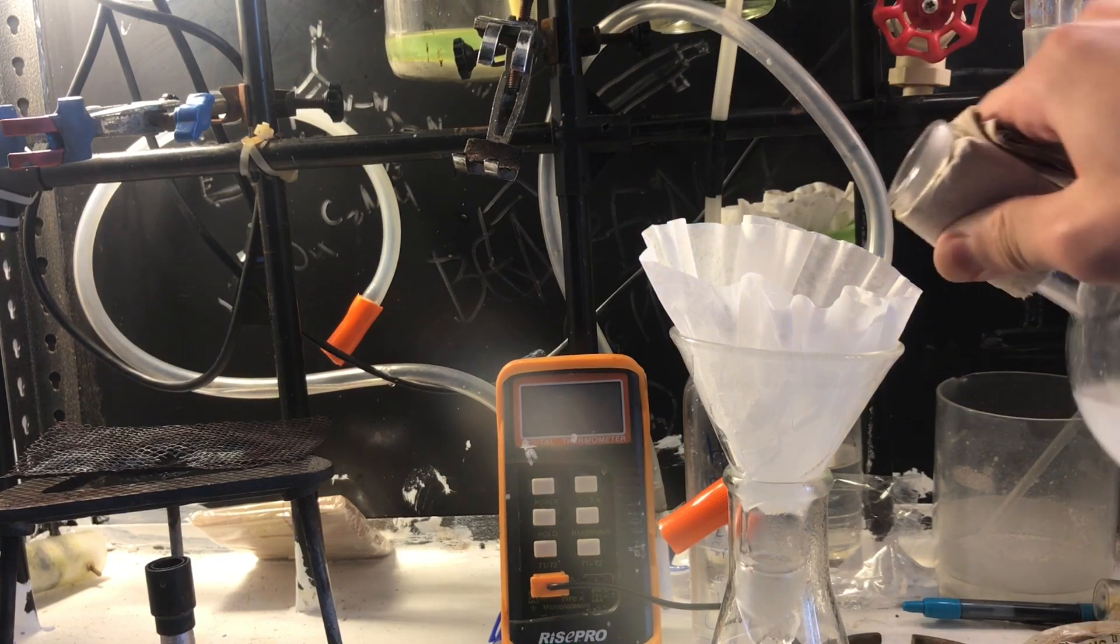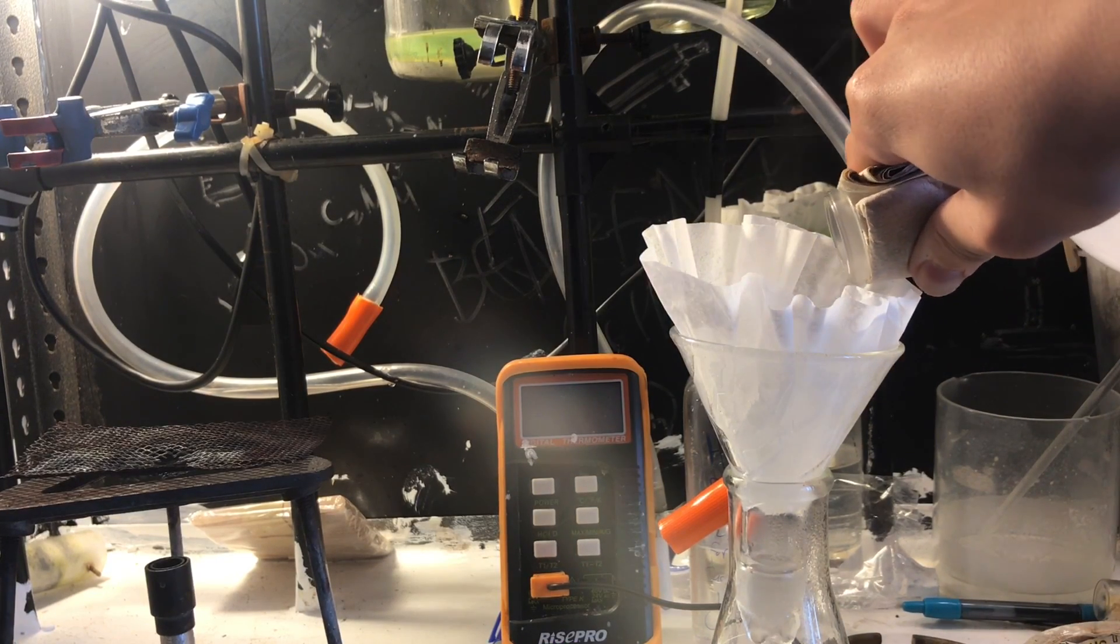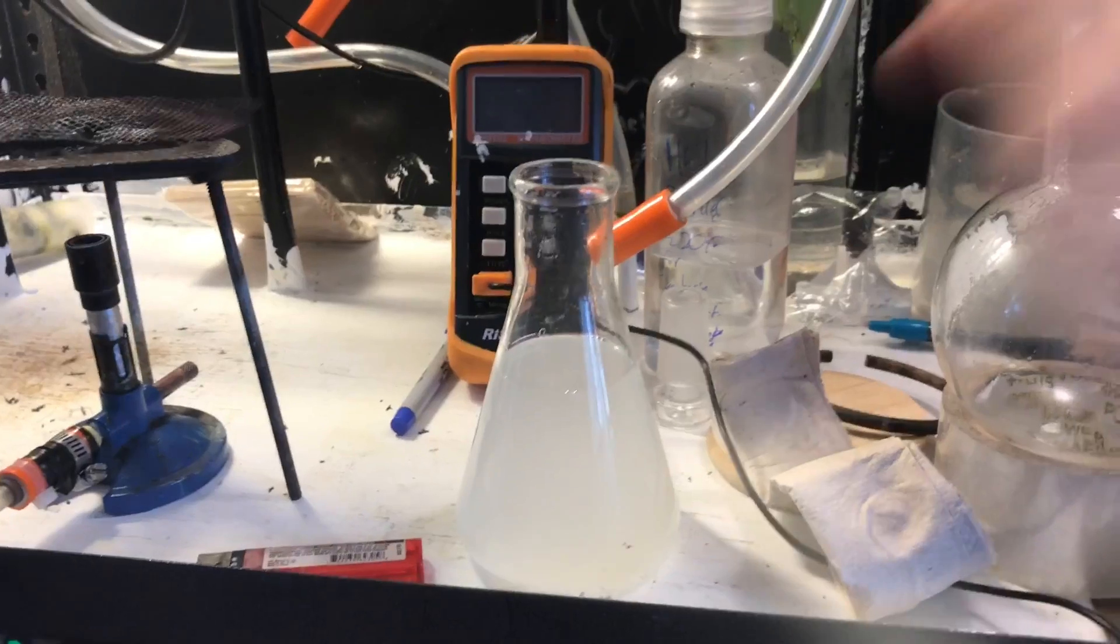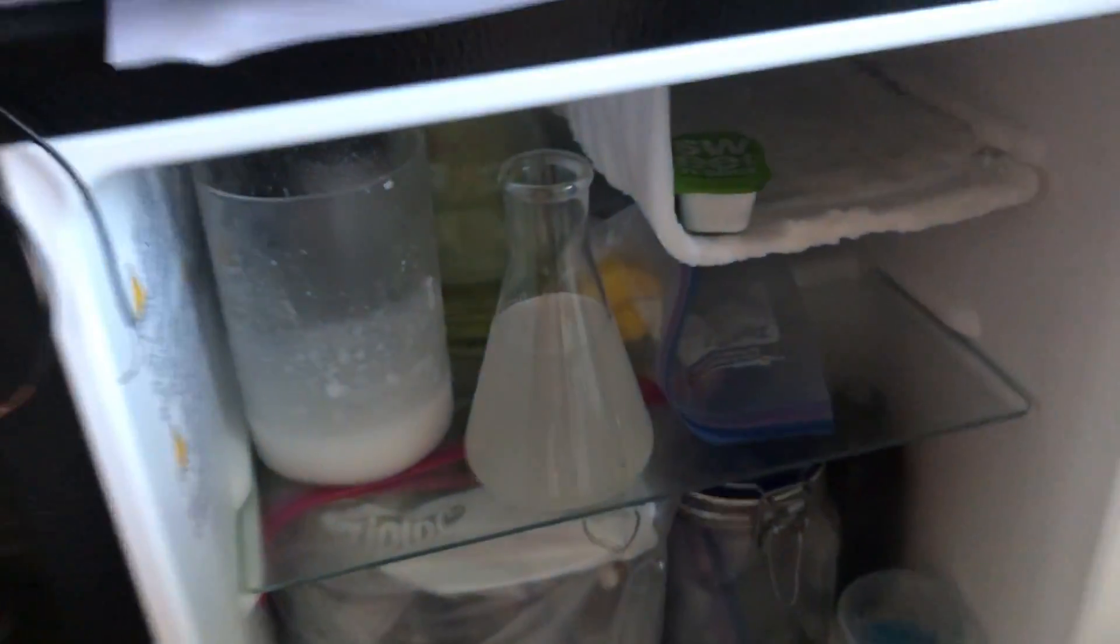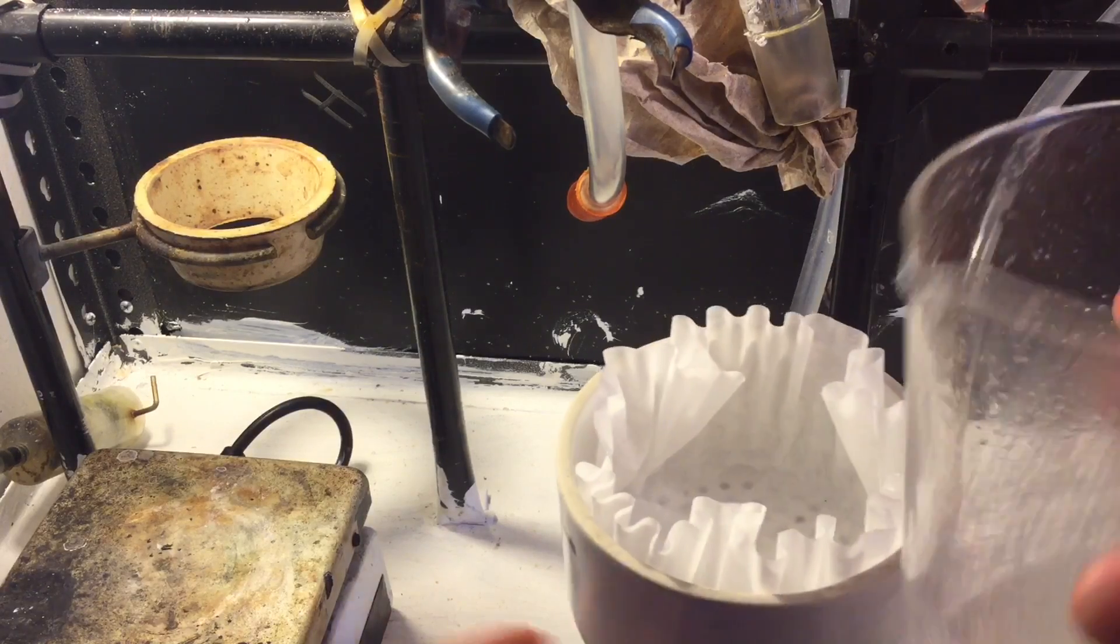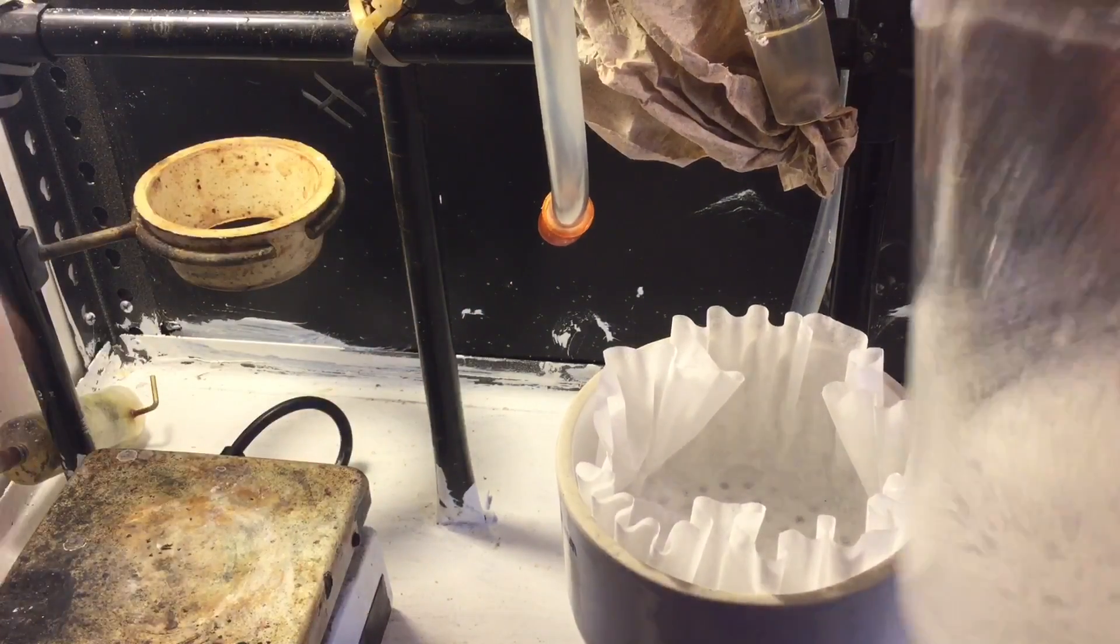Just filter it, and that's basically it, let it crystallize. However, as you can see, I put mine in the refrigerator, but it did not crystallize. There was too much water in it still, so I just ended up boiling it down into a sludge, and then just filtering that sludge for the sodium bisulfate crystals.